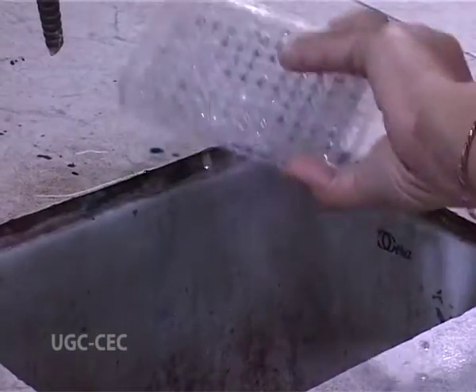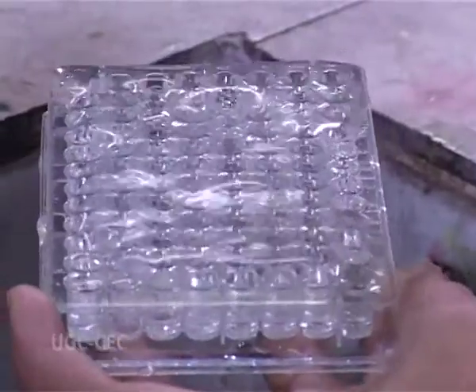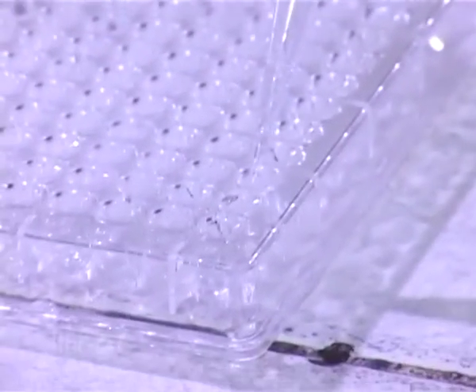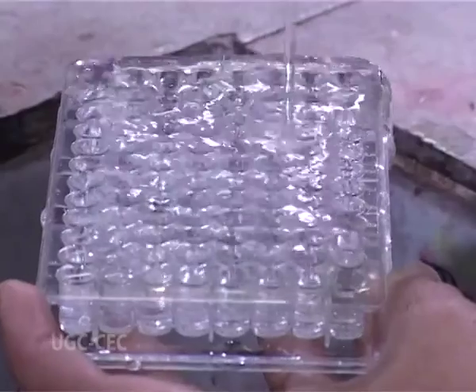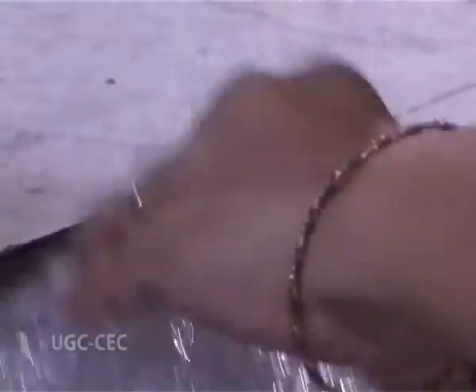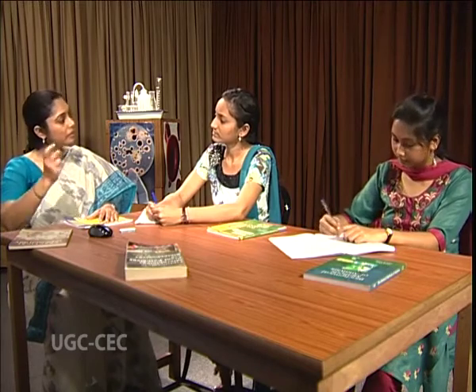We have to then again wash the wells so that excess antibodies or unbound antibodies are washed off from the wells. Next, we will add an enzyme tagged secondary antibody specific for the primary antibody used here. And after washing and incubation, we will add the substrate, and just seeing the color change and intensity of the color, we can find out whether the specific primary antibody is present in the sample or not. And if it is present, then from the color intensity we can find out its amount.